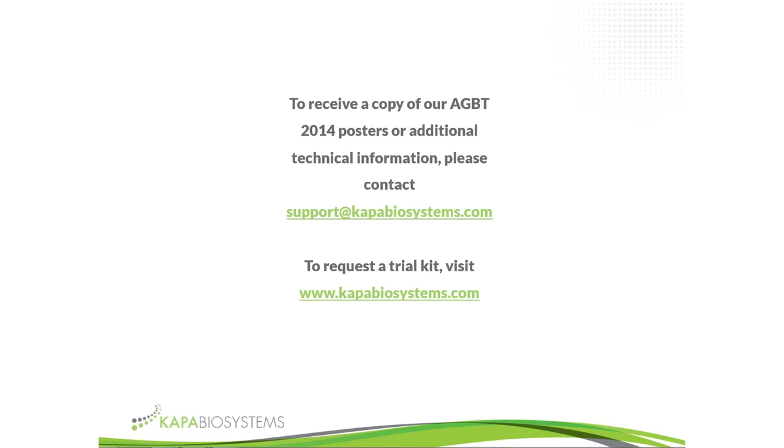For example, with our with-bead protocol, we recommend a 10-to-1 adapter insert molar ratio for good quality DNA. For FFPE quality DNA, we say double that at least, so work at 20-to-1, maybe up to 40 or 80-to-1. But at that point, we start making so much adapter dimer with the three-step chemistry that we can't clean it out properly. With the Hyper Prep kit, people have gone up to adapter insert molar ratios in the hundreds and even up to 1,000-to-1 without an issue of having so much adapter dimer. So the chemistry basically inhibits the adapter dimer formation as well.